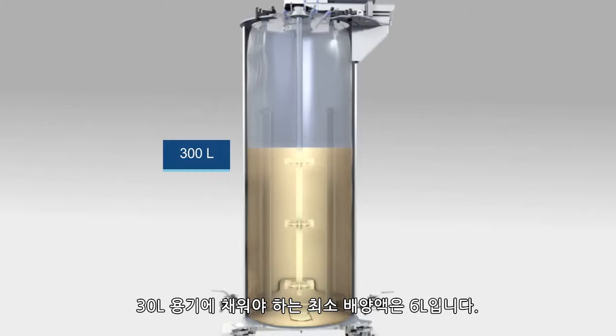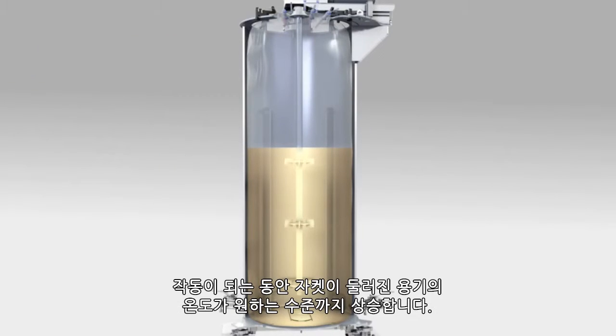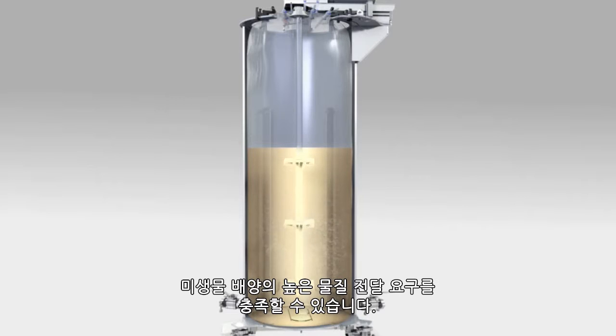The minimum media fill for the 30-liter vessel is 6 liters. During operation, the jacketed vessel heats up to the desired temperature. The combination of the three Rushton impellers and the four external baffles guarantees a uniform mixture and meets the high mass transfer demands of microbial culture.